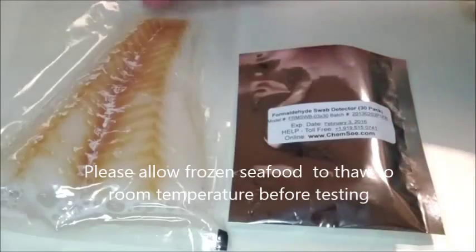First, allow any frozen fish to thaw at room temperature before conducting the test. Once the fish has been thawed, place it on a flat surface.